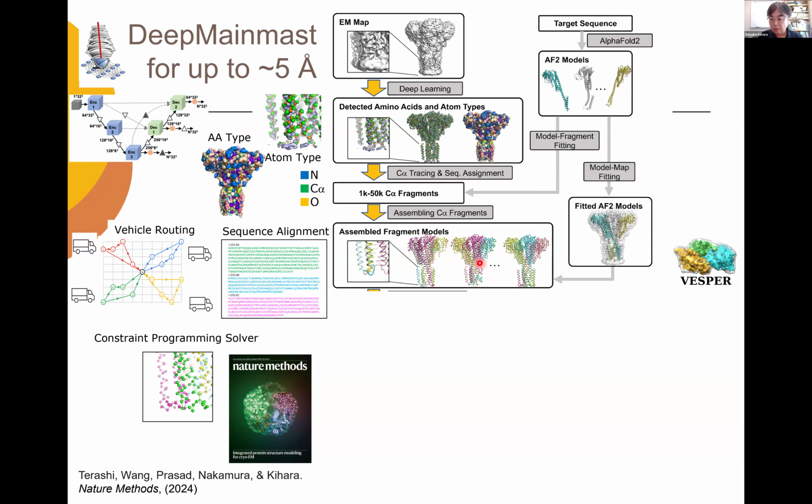We also use AlphaFold, or you can use your own structure. AlphaFold does a very good job in the modeling, but probably you notice that when you use AlphaFold 2 or 3, sometimes AlphaFold gives a very good fragment or domain, but the entire structure is not right for your specific cryo-EM map. So although we use AlphaFold to model, we only use fragments when they fit the density in at least the majority of the residues.